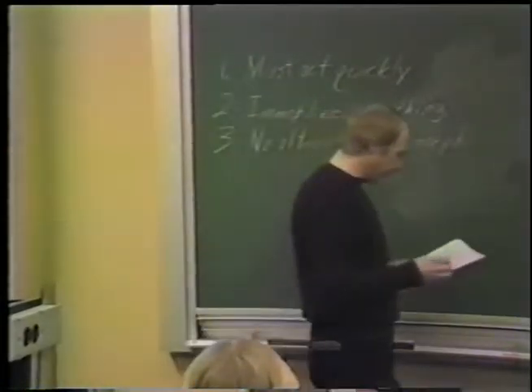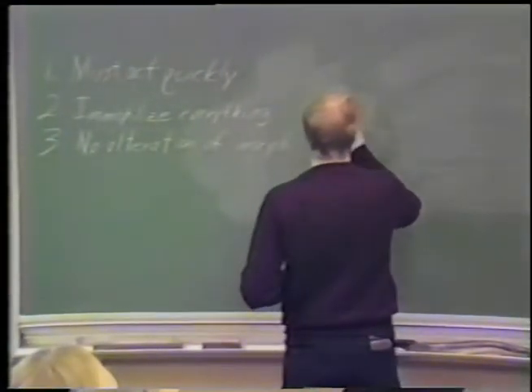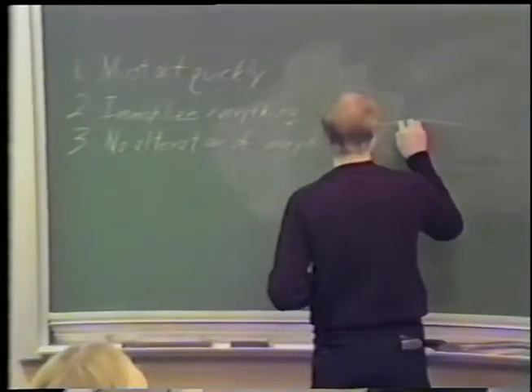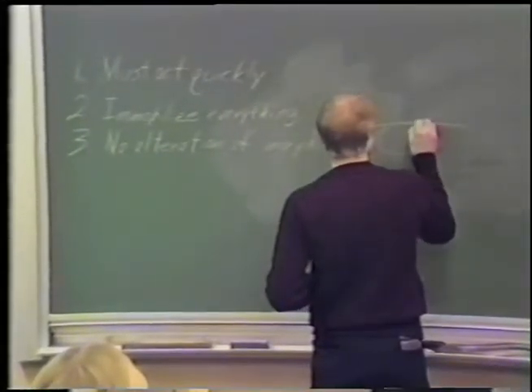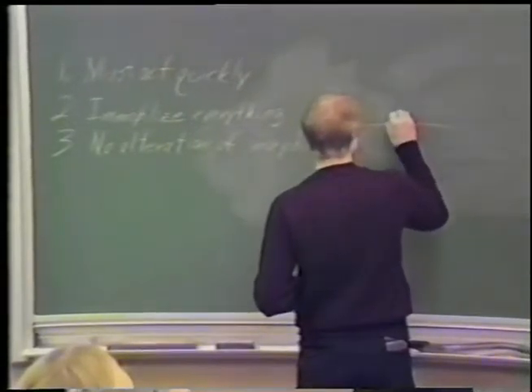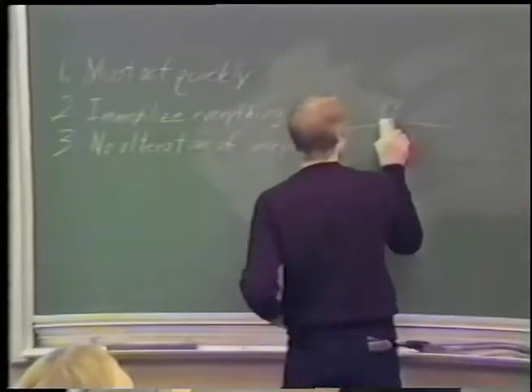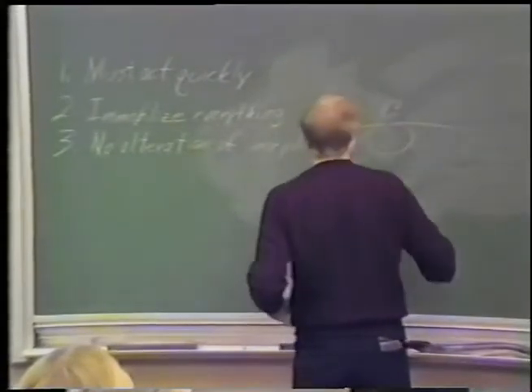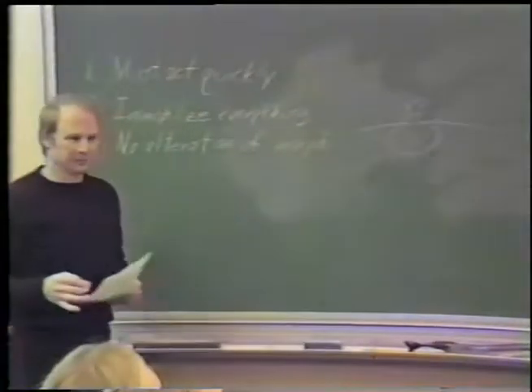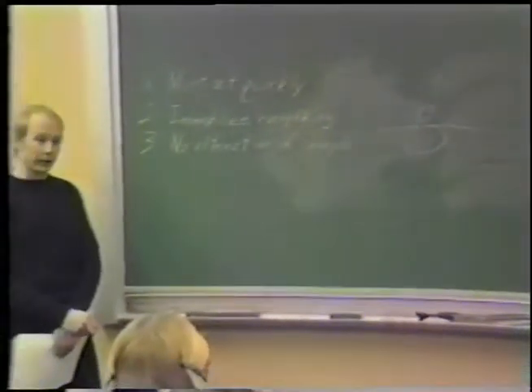Glutaraldehyde, in addition, has been demonstrated to give rise to vesiculation of the plasma membrane in regions of vesicle-plasma membrane contact. You see a vesicle in close approximation to the plasma membrane. And either before or after apparent fusion has taken place, you'll see a number of smaller vesicles in the vicinity. These were thought to be real for some time, and it turns out they probably are not in most cases.